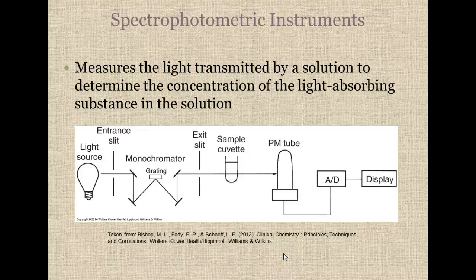One of the first spectrophotometry labs you'll be doing is an albumin test on human serum. We are going to mix some human serum with a reagent, which again is the chemical that drives the reaction, and it's going to create a color in the test tube. The darker the color, the more albumin there is. The lighter the color, the less albumin there is.